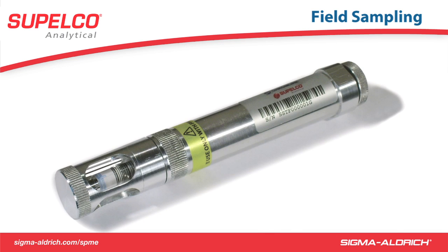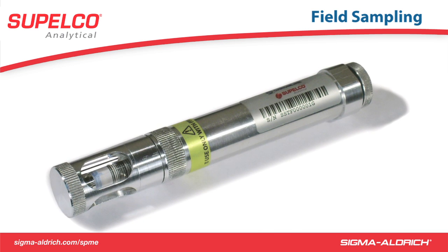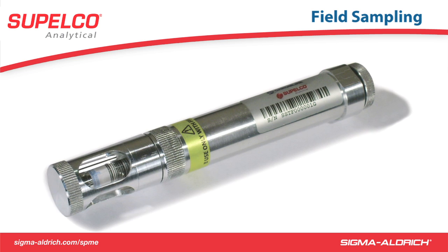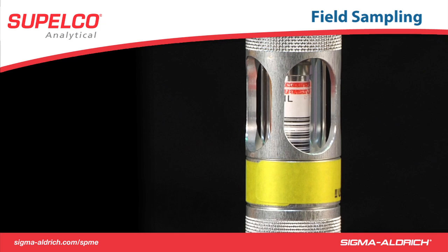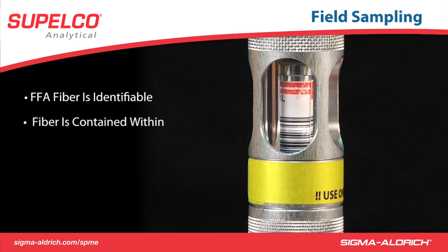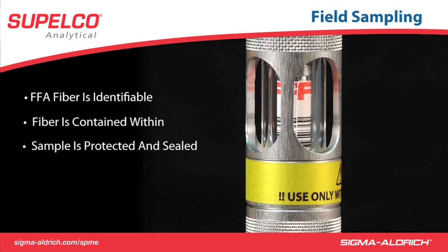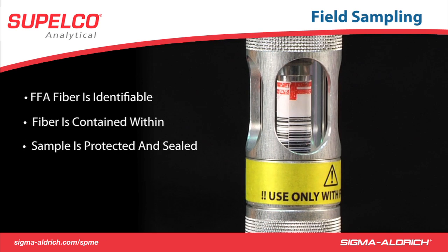Alternatively, the FFA could be taken out of the field sampler and placed into an SPME-FFA storage container for shipment and storage. If using the storage container, one can still see which FFA fiber is being contained in the container through a window at the top. The fiber can be identified by the lines and color codes on the label.